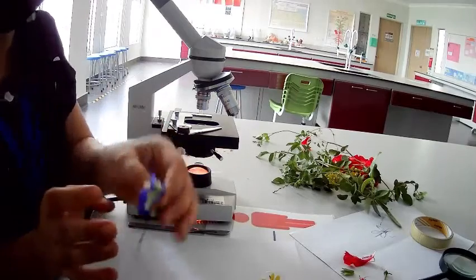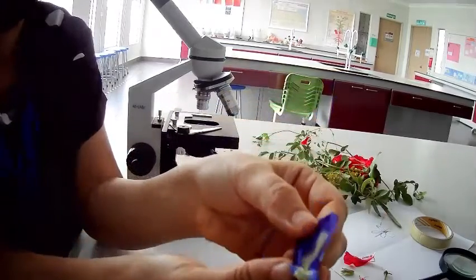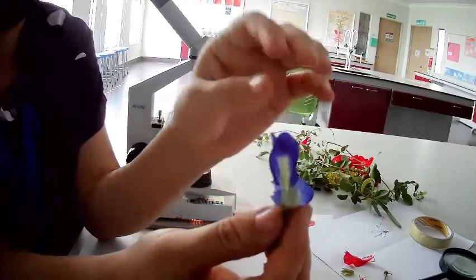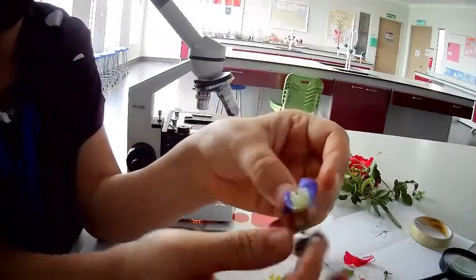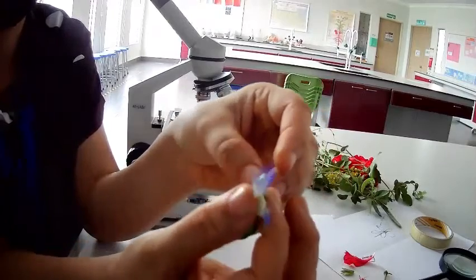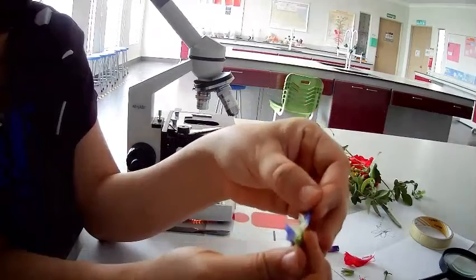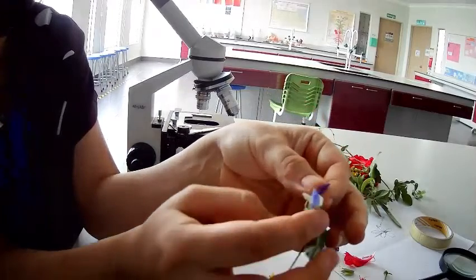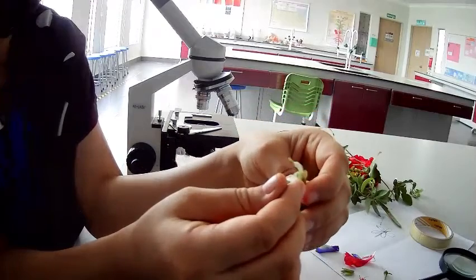Well, I just want to show now another flower and different structures of it. Look at this flower now. When you look at it, you don't see anything, or there are just the petals. This is a petal. I want to see the inner structure to find the female and the male part. I have to take this one off. So I'll also remove this one, until I reach the inner part.